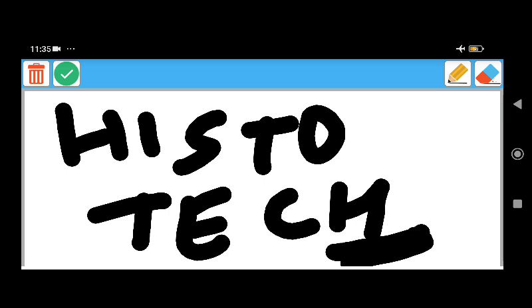Hematoxylin is extracted from logwood. Oxidation of this extract produces a colored substance, hematin, which forms the stain. Oxidation may be achieved by either natural or chemical method. The advantage of the chemical method is that the stain can be used as soon as it is prepared. It stains nuclear chromatin.